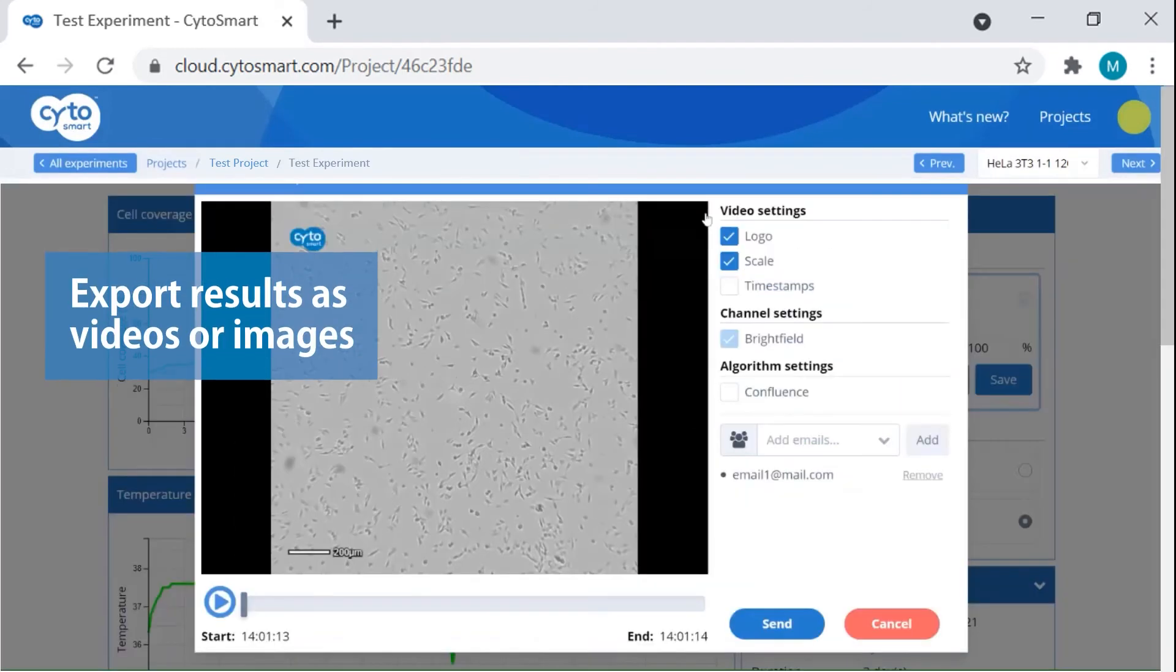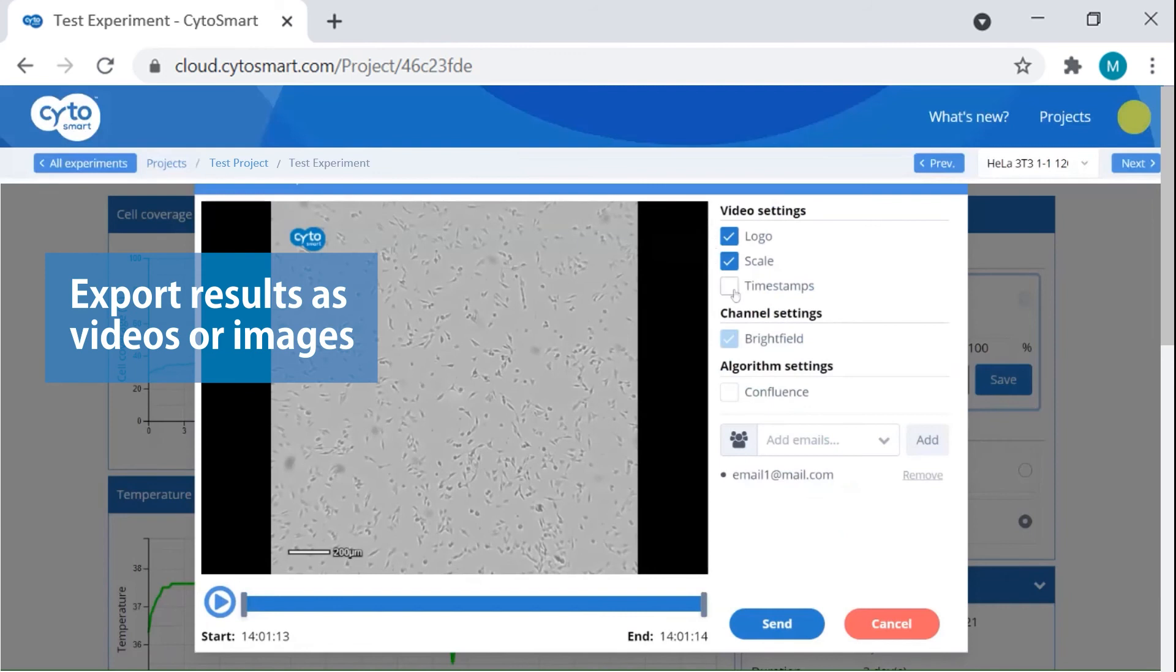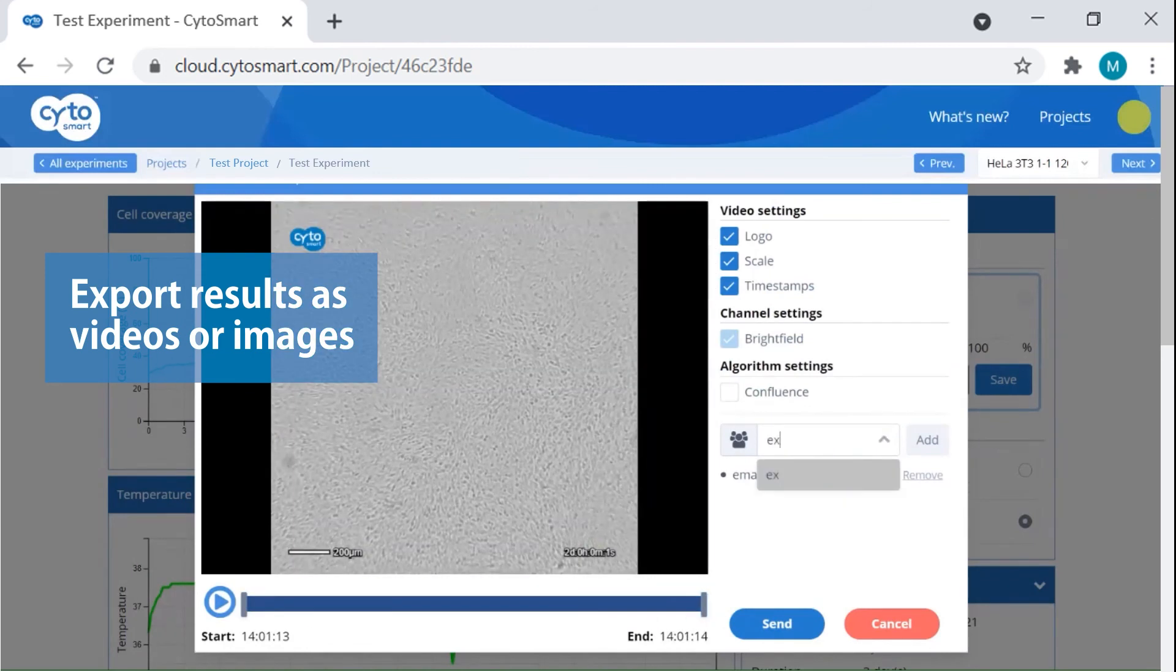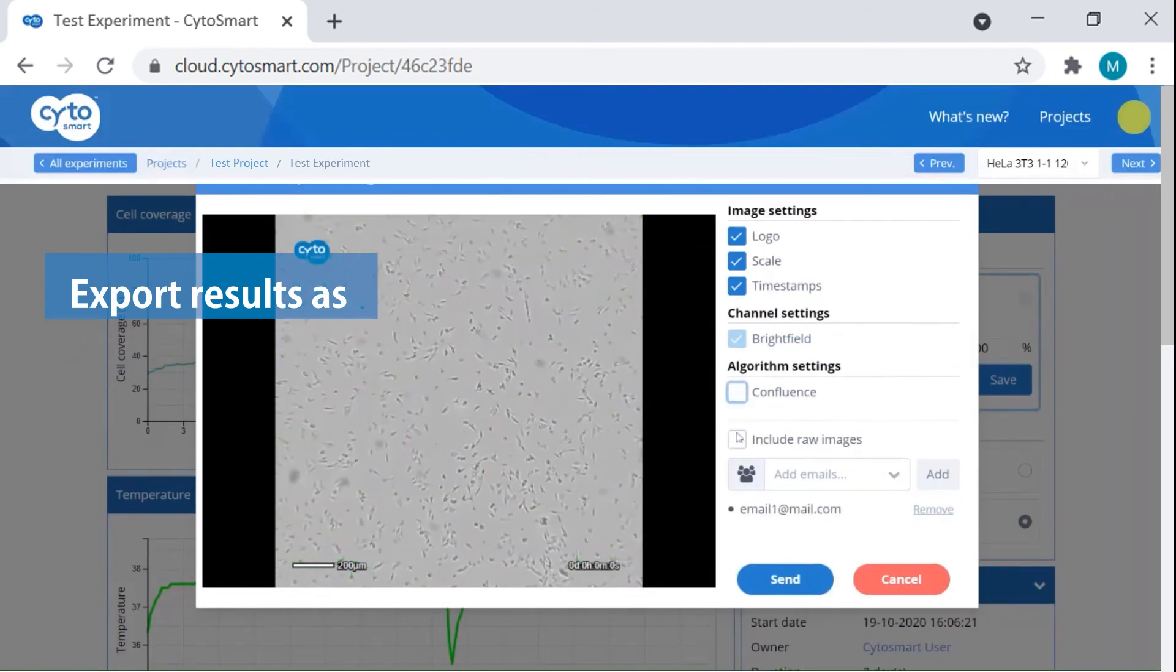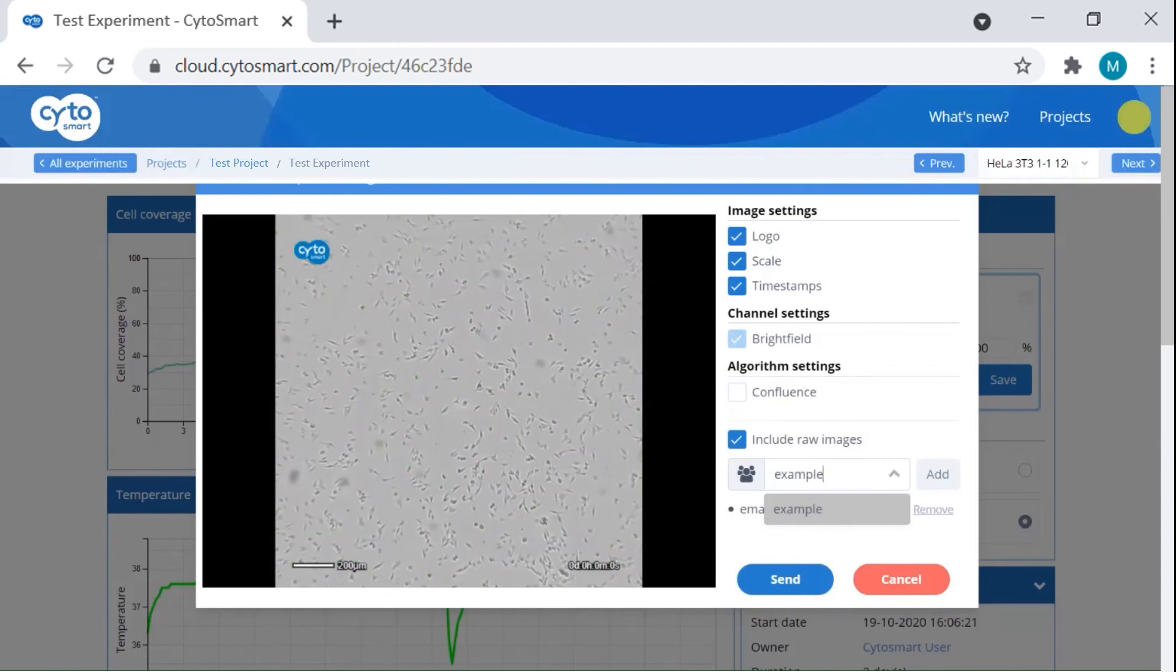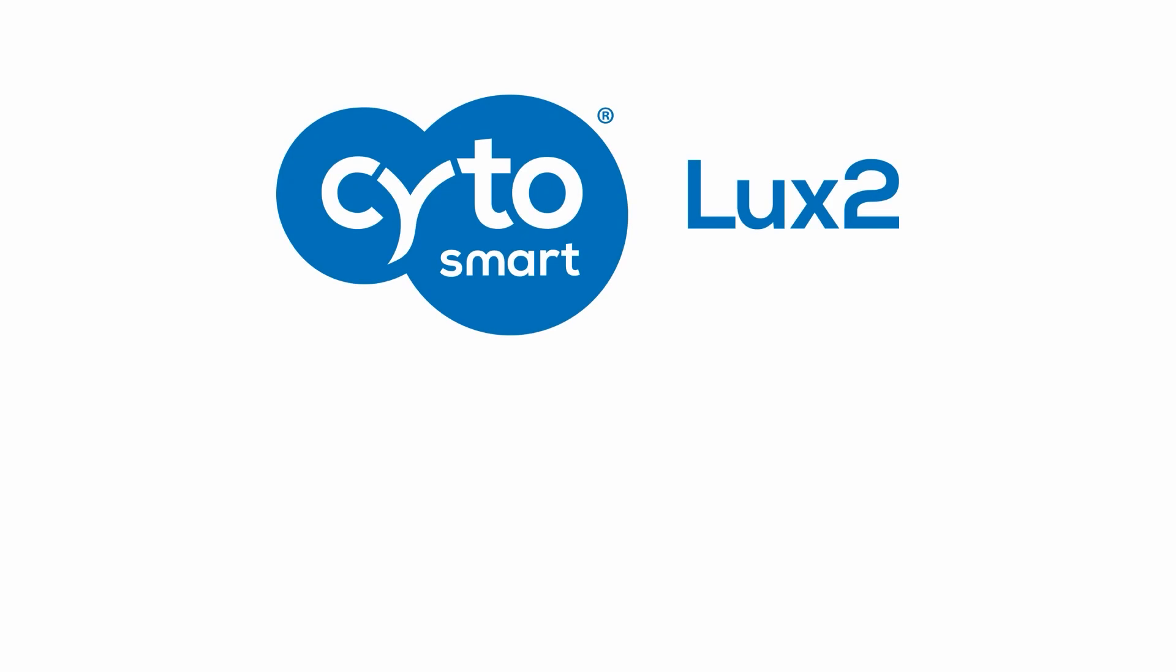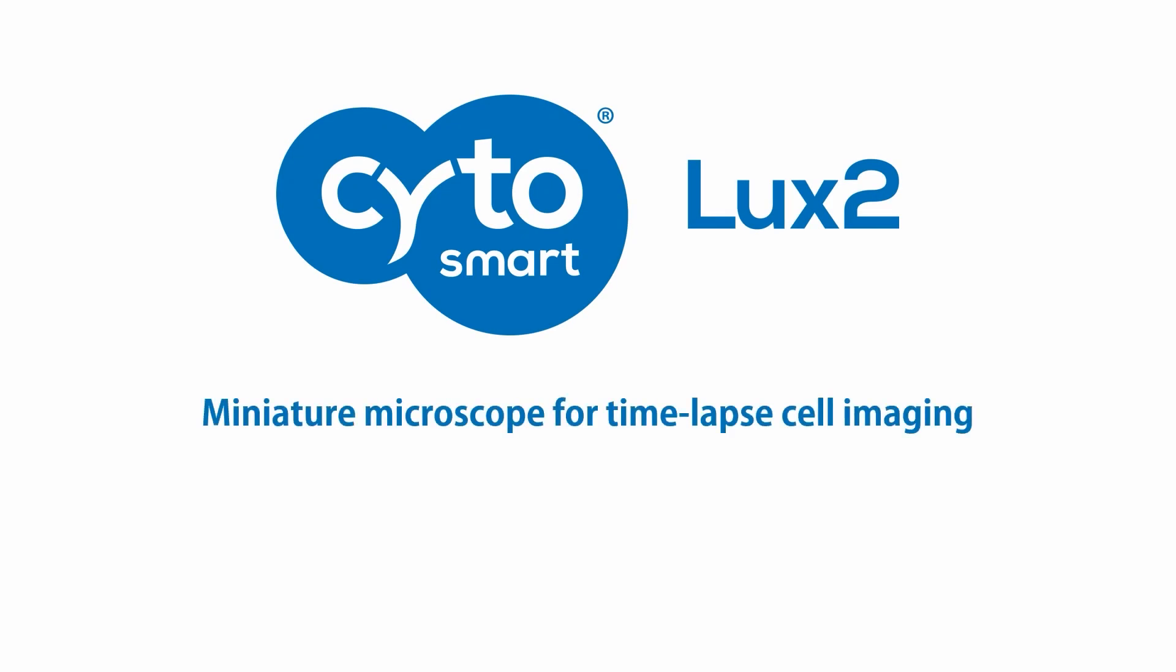When you're satisfied with your results, you can export them as videos or images. Easily share great results with your colleagues. Enjoy your experiments with the Cytosmart Lux2.